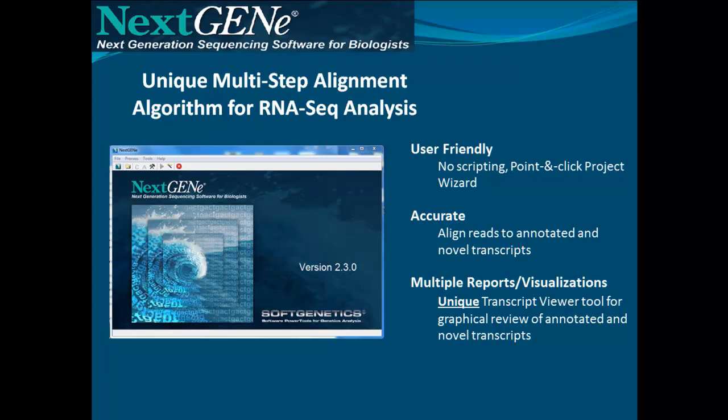NextGene Software is a user-friendly software package that does not require any scripting. The software package features a multi-step alignment algorithm designed for RNA-Seq analysis. It aligns reads to a reference file that is then used to identify variations in an annotated transcript, as well as identify novel transcripts. The software comes with an integrated NextGene Viewer that has a unique transcript view and outputs many different types of reports.